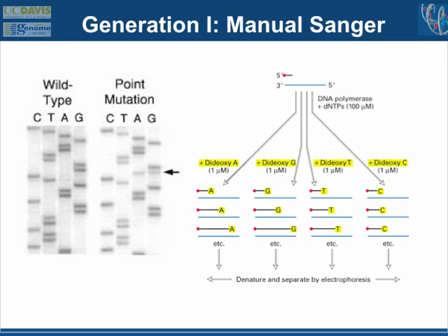And this was the way it worked for sequencing for 10 or so years. And it was painstaking and slow. Some people developed semi-automated methods to read these X-rays, to scan in an image of this and try and read the DNA sequence off of those X-rays.